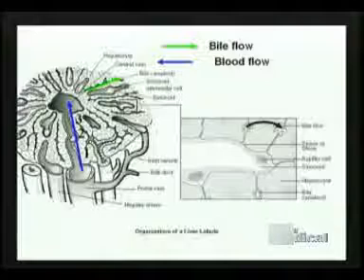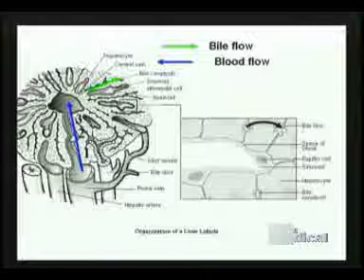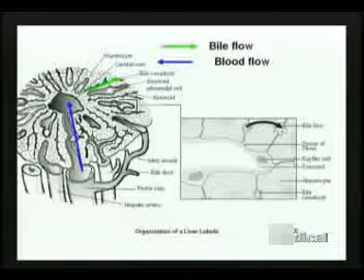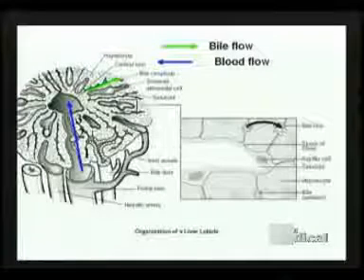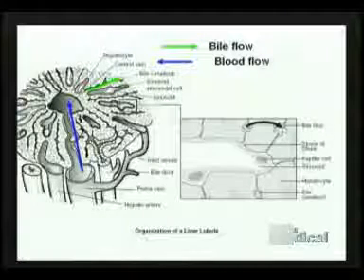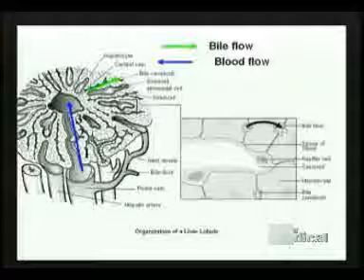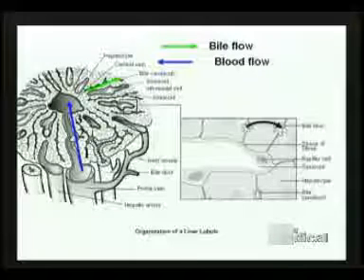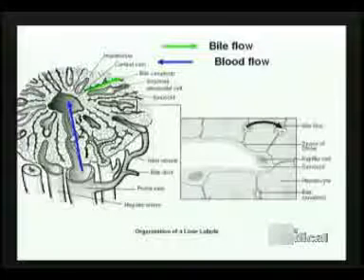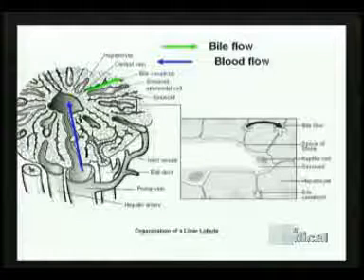So in the inset diagram on the right side of this page, you can see a liver sinusoid, basically lined by a discontinuous sinusoidal endothelium. Inside the lumen of that sinusoid, we find the Kupffer cells, the macrophages associated with the liver. And between those sinusoidal endothelial cells and the luminal surface of each of the plates of hepatocytes is the space of Disse. The space of Disse is basically where all of the endocrine-based products of a hepatocyte are released into the bloodstream. They would be albumin, prothrombin, and so on and so forth, proteins.